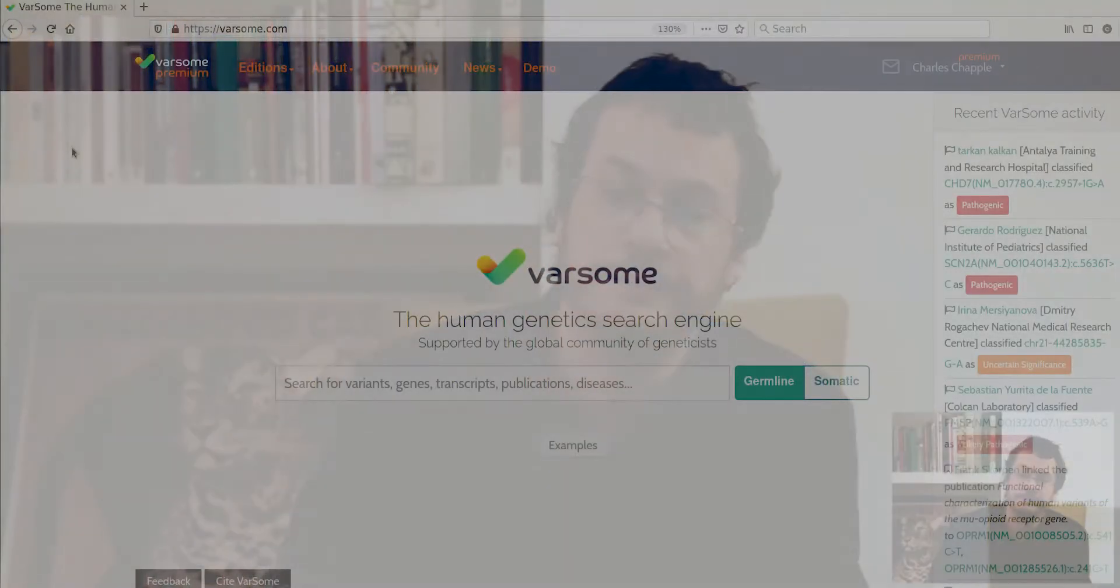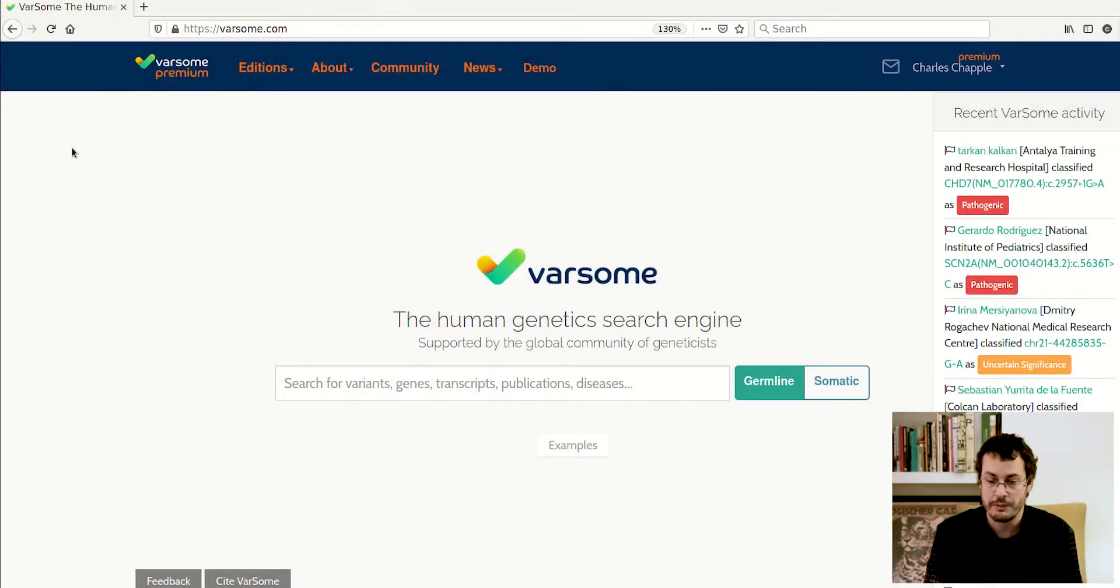Hello, my name is Charles Chappell and I'm head of bioinformatics at Varsom. You are probably familiar with Varsom, but what you may not be aware of is that users of our Varsom premium paid service can also annotate and classify somatic variants, and we will classify these using our automatic AMP classifier. Here's how it works.